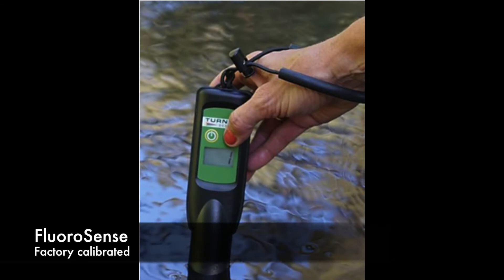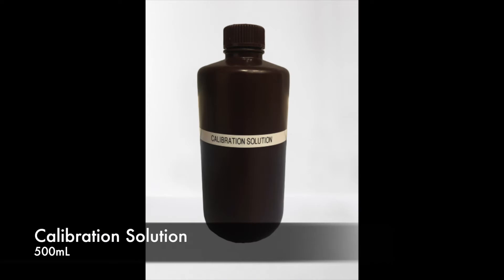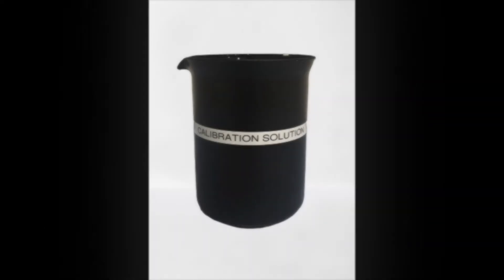The Fluorosense is factory calibrated, but if you would like to calibrate your instrument, you will need the calibration solution corresponding to your model and a black 500 ml beaker.